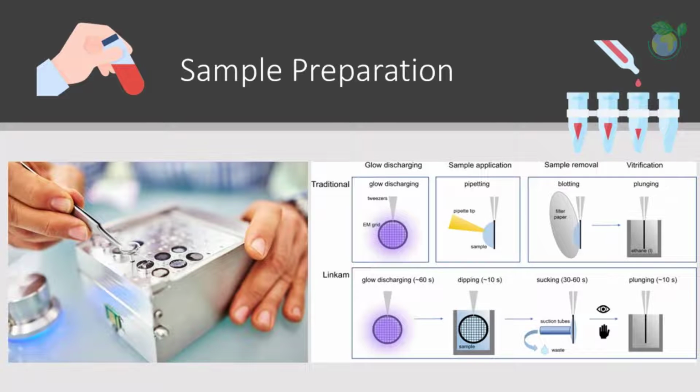Sample preparation is still an important limiting factor in achieving high-resolution structures using cryo-EM. Membrane complexes are among the specimens that benefited the most from the new advances in cryo-EM, as they meet the requirements for which cryo-EM is best suited. Membrane complexes are normally difficult to prepare in large quantities and to isolate in their intact form because detergents have to be used.